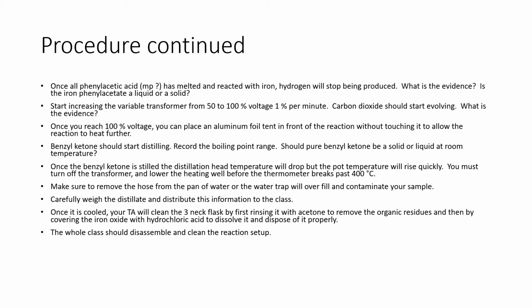So now with this high heat, the benzyl ketone should begin to start distilling, and we can eventually start collecting it in that round bottom flask. Just remember, you would normally want to record the boiling point range, so when the stuff is boiling. Just to follow along, it's very important that you've watched Dr. Salvador's video, because you'll be able to see if our pure benzyl ketone is a solid or liquid at room temperature.